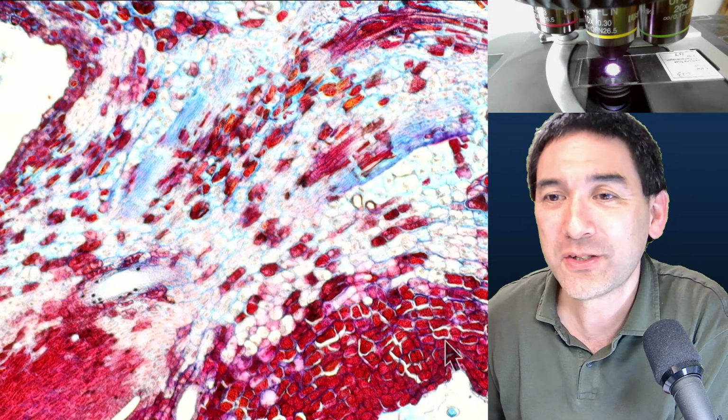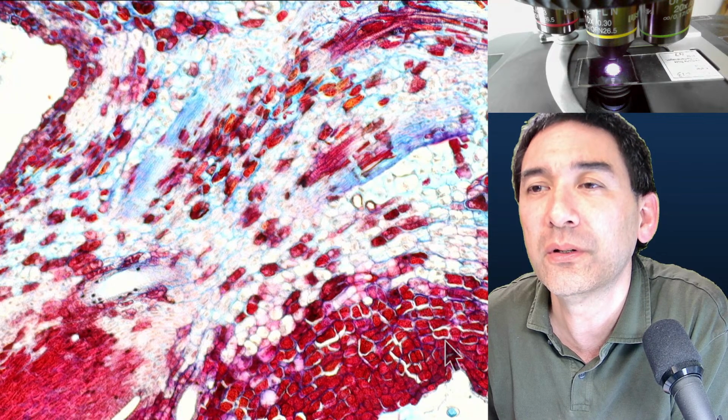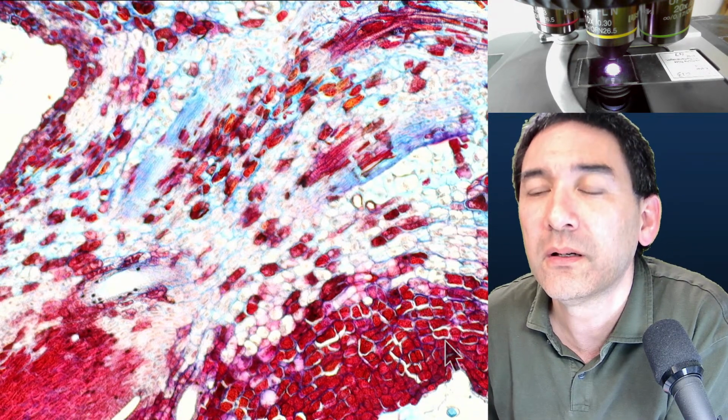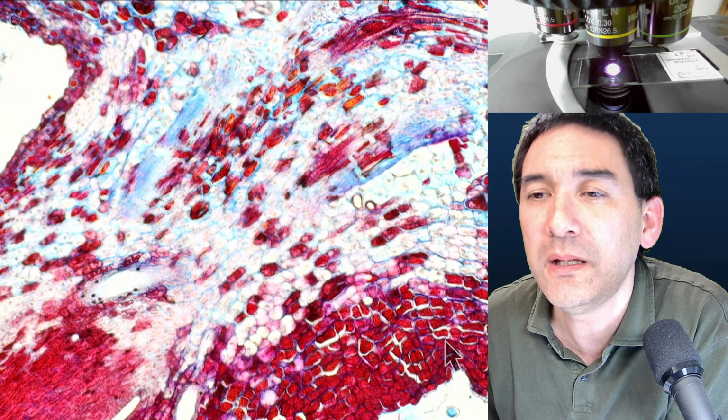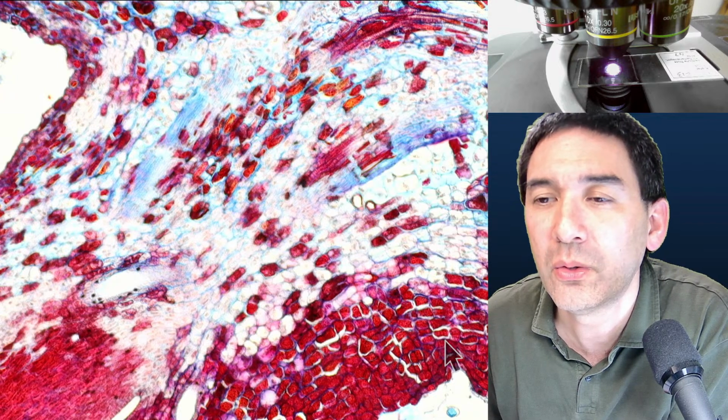So I'm going to go through here. I hope I got the sequence correct. Dark field. Do you have amoeba? Okay, some people are saying hello.